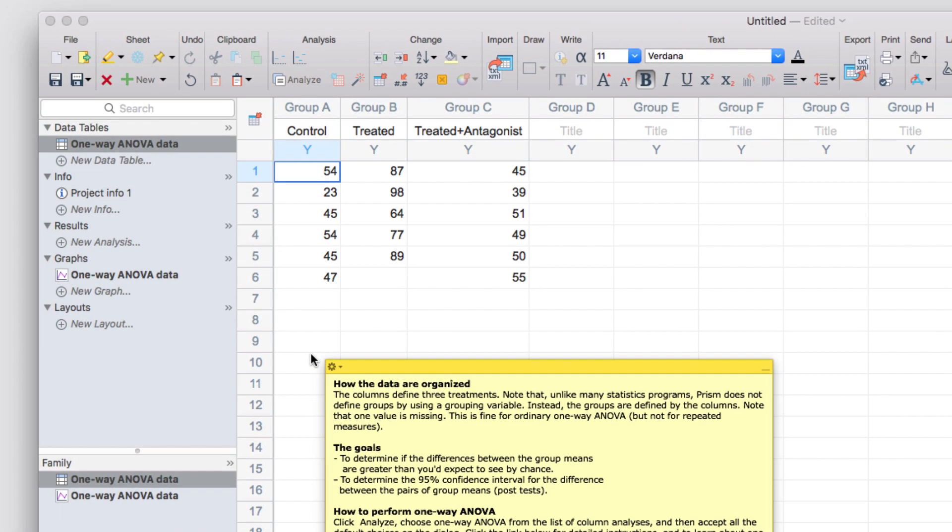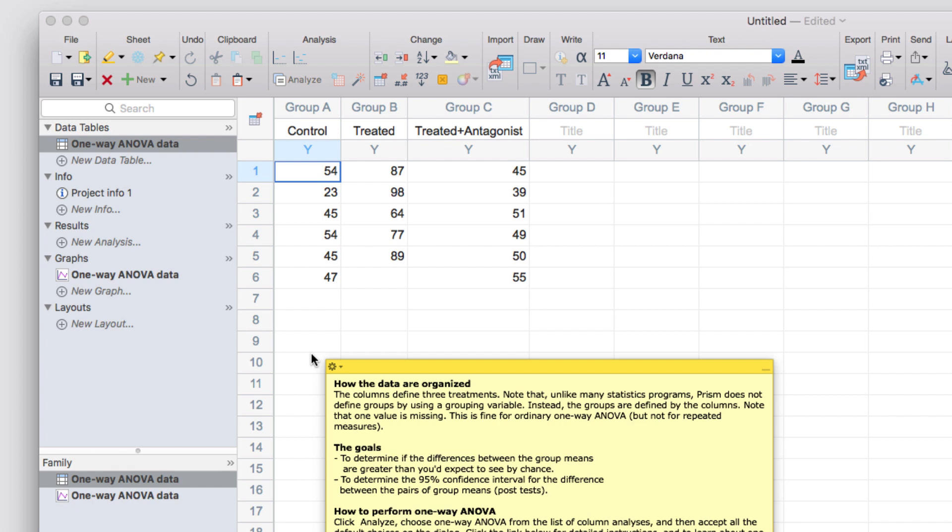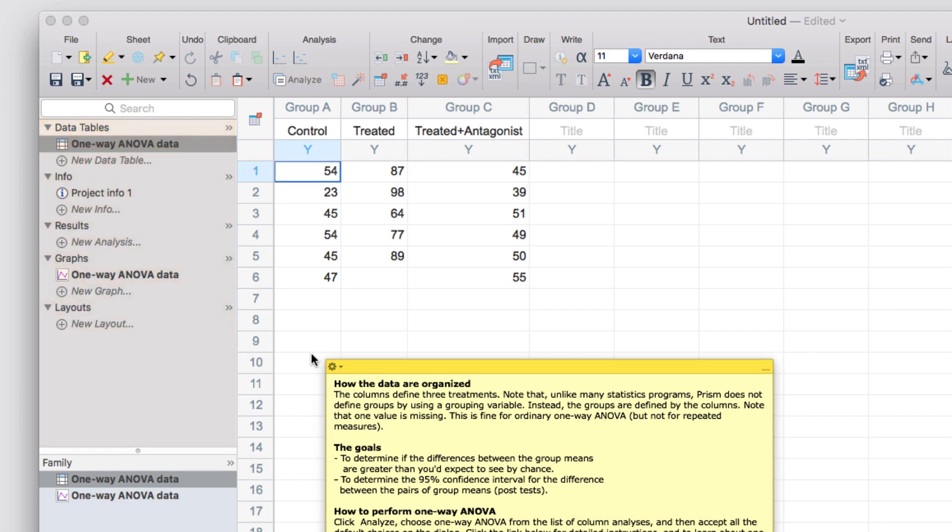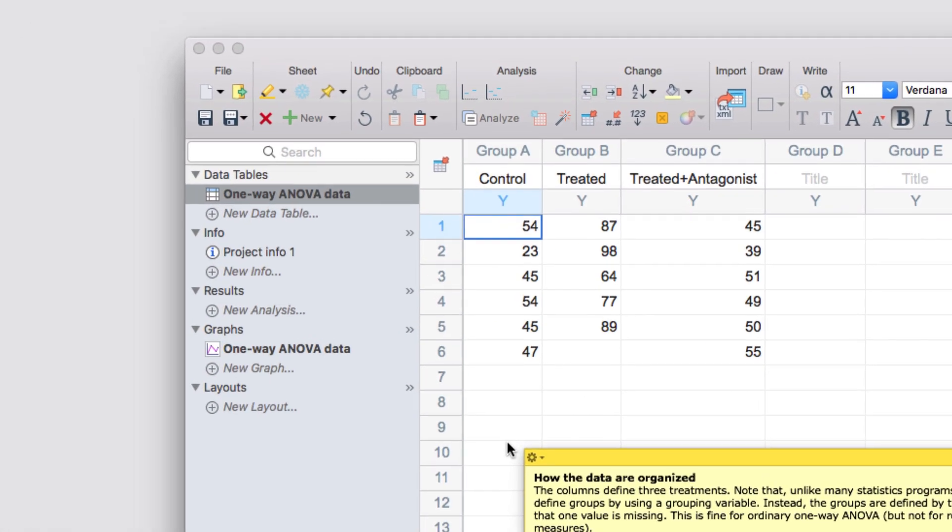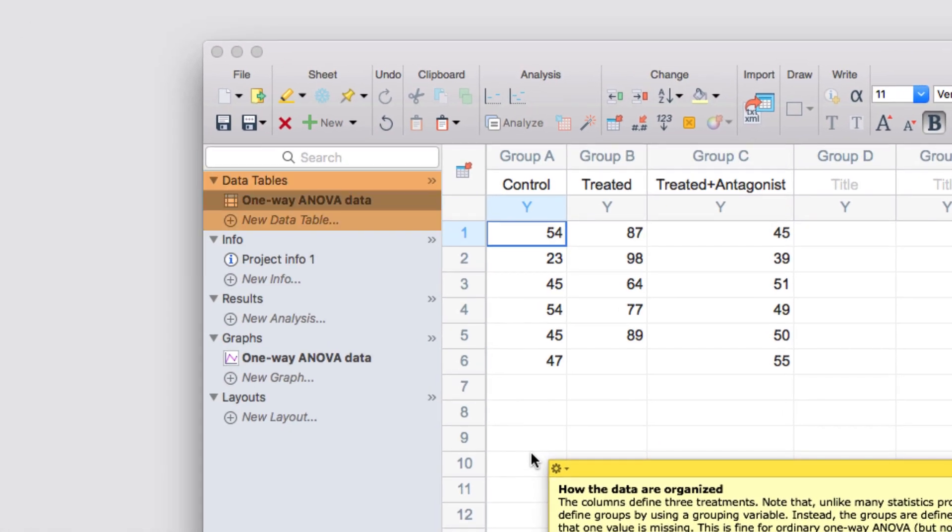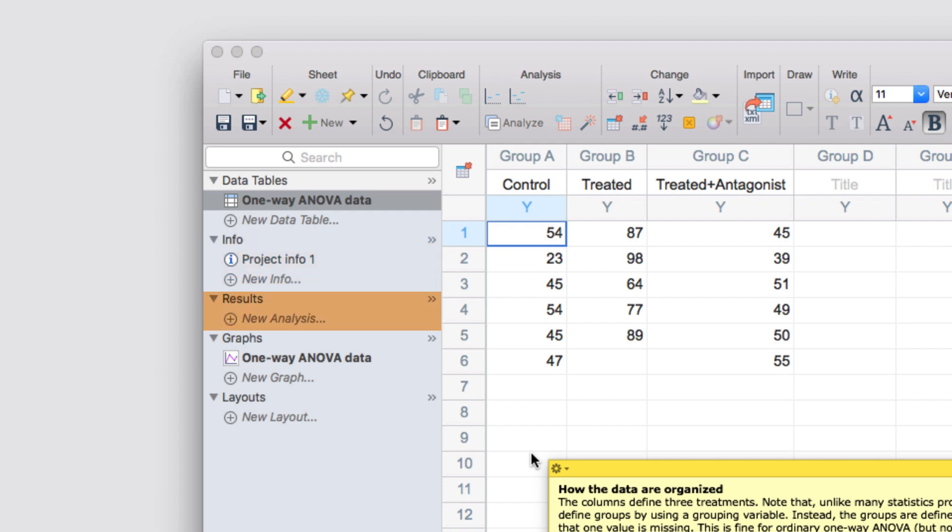In addition to the toolbar on top, the other very important section of a Prism project is the Navigator panel on the left. In the Navigator, all of the sheets of your Prism project file are organized by whether they are a data table, a project info sheet, an analysis results sheet, a graph, or a layout.